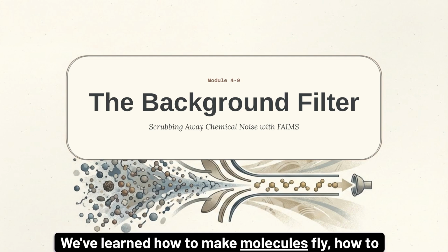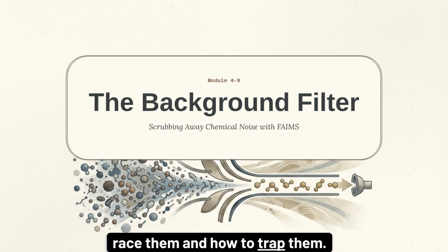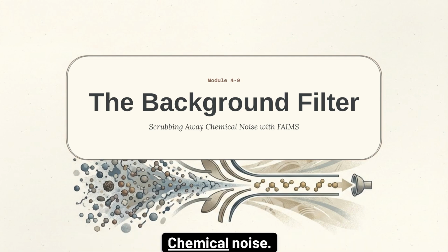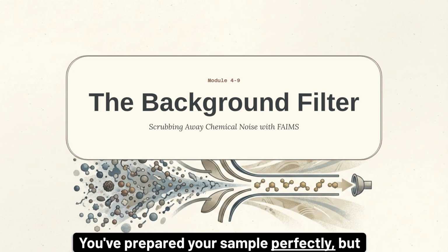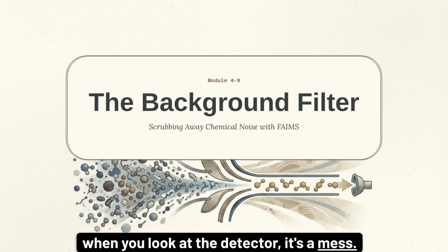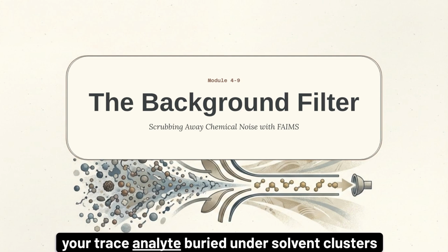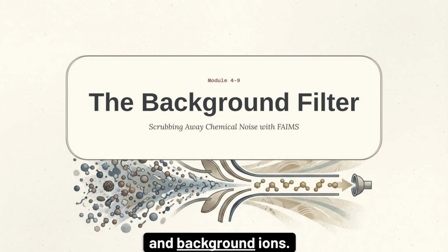We've learned how to make molecules fly, how to race them, and how to trap them. But let's talk about a reality that ruins many promising careers: chemical noise. You've prepared your sample perfectly, but when you look at the detector, it's a mess. Find a white cat in a blinding snowstorm? That is your trace analyte buried under solvent clusters and background ions.